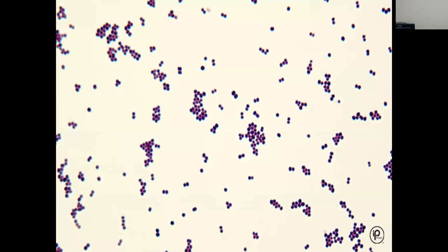All right, so here's our great gram-positive Staphylococcus. We said, hey, they could be single. They could be pairs. They could be clusters, right? So this is what usually occurs when we put our organism on the slide and we disrupt the colonies themselves, we scatter this, okay? So this is usually our doing. So this may or may not be a diplococci, okay? We just have to see what's the majority, but usually what we'll see is if there are three over here, and then there's a pair, that may not be a strict diplococci. Okay, so beware when you're looking at a Gram stain, it may be a little bit deceiving at first as to what you really have.